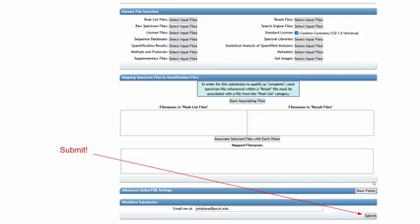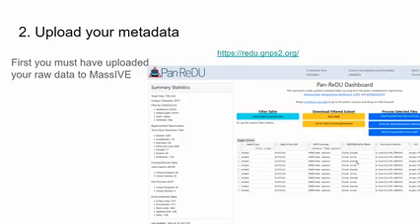After this, it's actually not public yet. There will be another step, but that's pretty intuitive after that, to make sure they're actually public and also reusable by other people and your reviewers of papers, and so on.